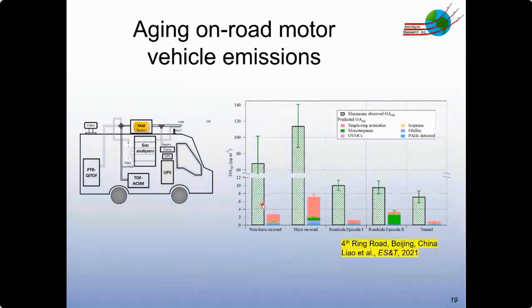But that was what they had to gain insight into the specific VOCs that are responsible for observed SOA formation. They drove around on the 4th Ring Road in Beijing and measured significant organic aerosol formation through the OFR, ranging from tens of micrograms per cubic meter to over 100 micrograms per cubic meter during a haze event.